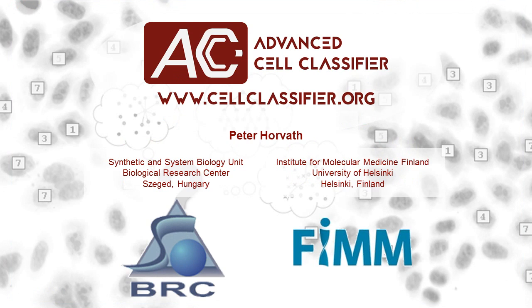You have now been given an insight into Advanced Cell Classifier's annotation methods. To learn more about the different parameters, please read the help documentation file provided with the software.